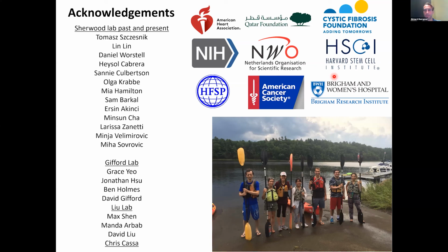So I guess there's two versions of materials. There's the biological materials, like any plasmid that we've cloned. We store them because you never know when you're going to use things again. Especially with these CRISPR guide RNAs, one project might target a specific gene, and then maybe 3 years later, someone else's project might want to target the same gene for a different reason. So the plasmids we tend to store.